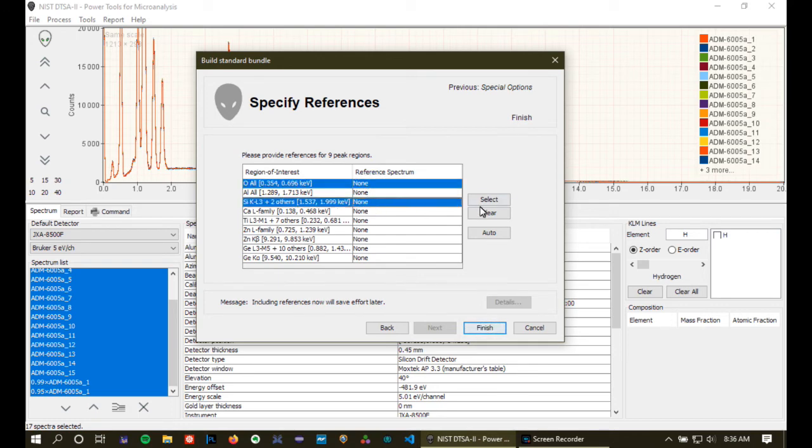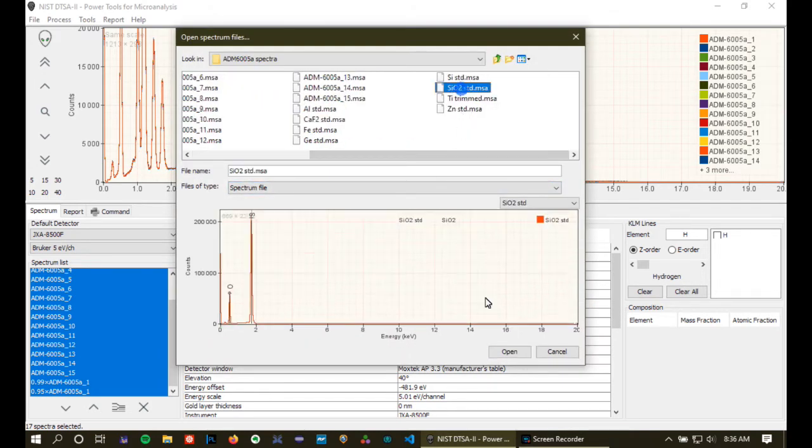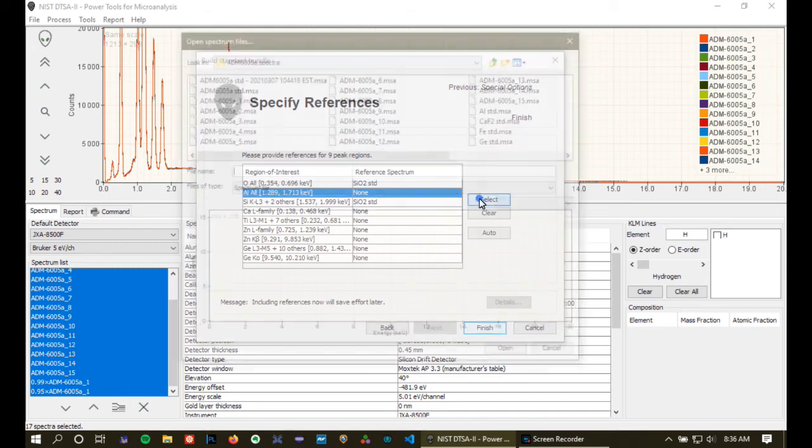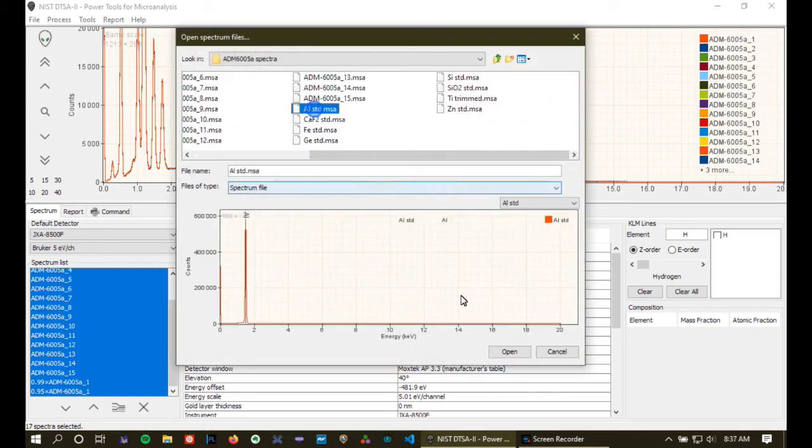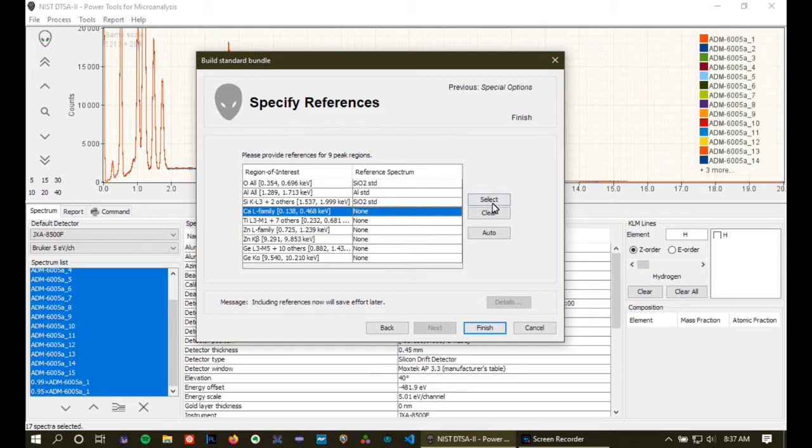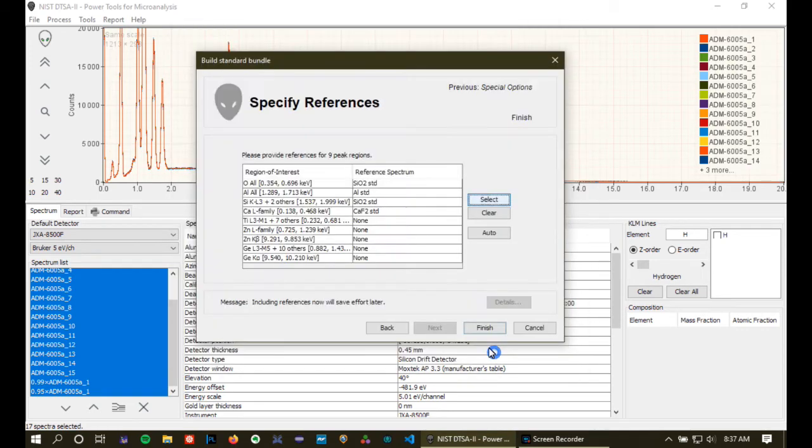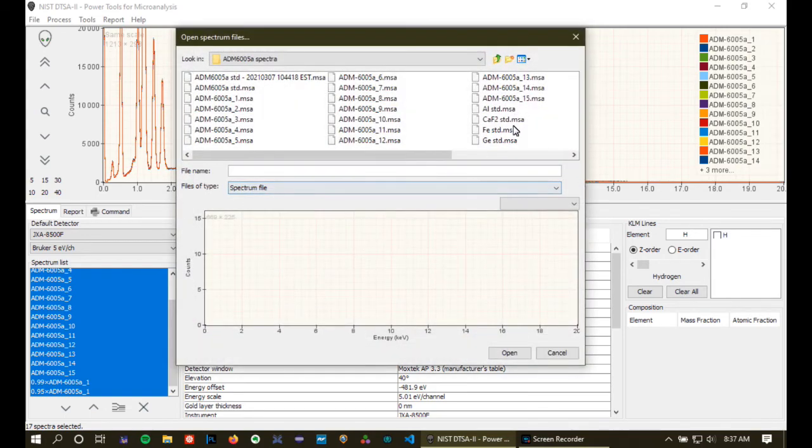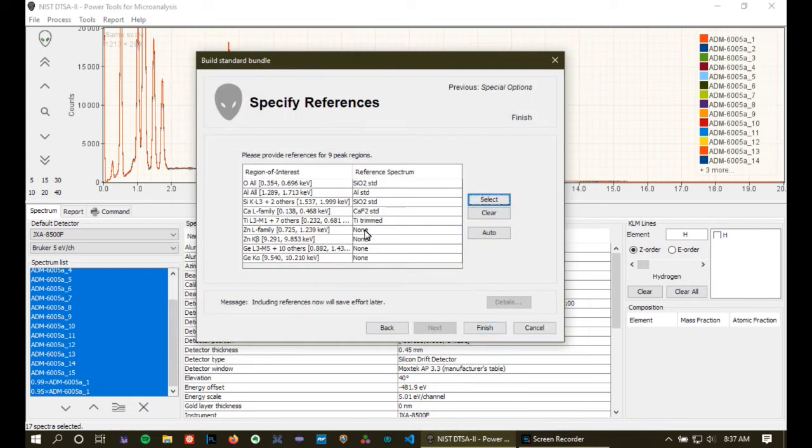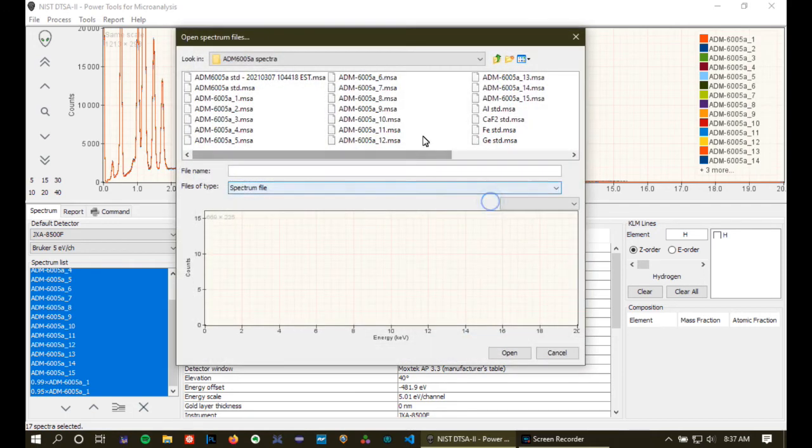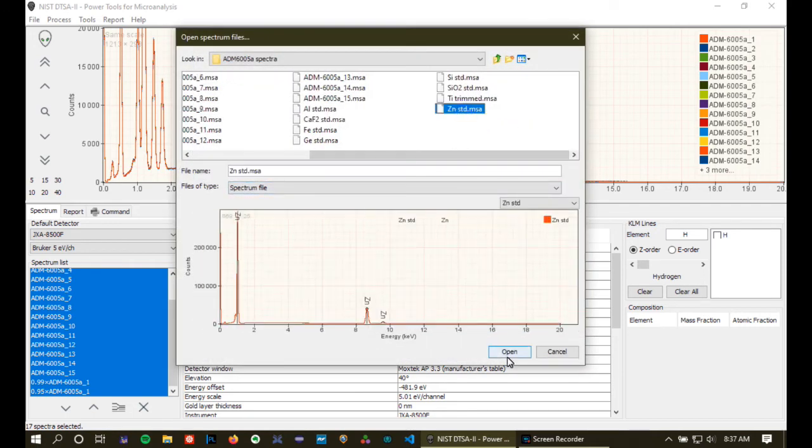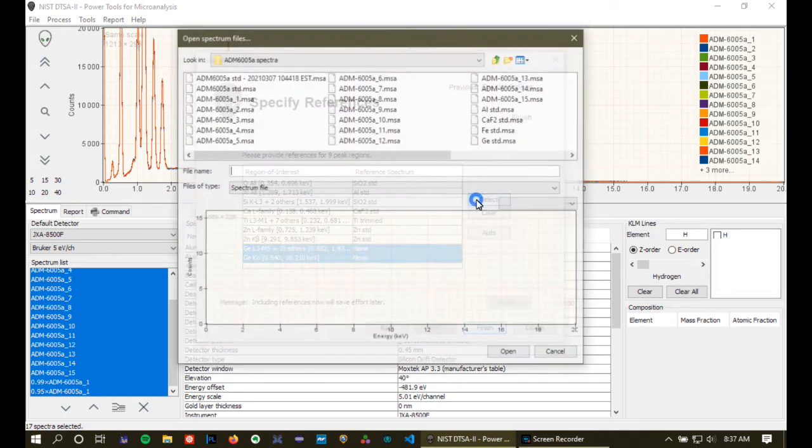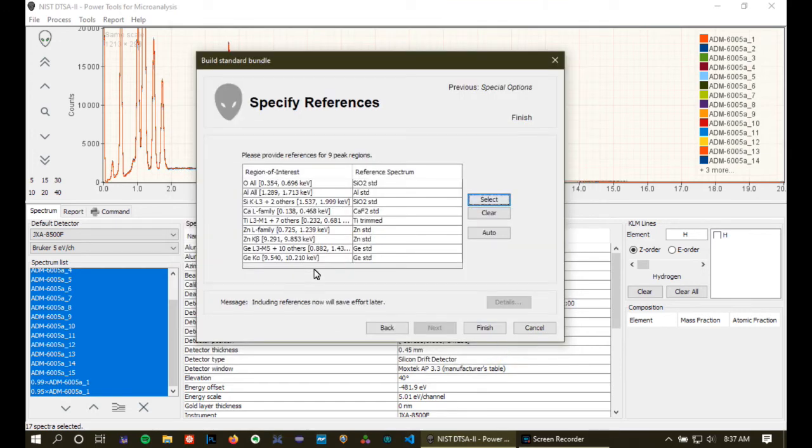In fact, we're going to use the spectra that we just used to quantify the material. So I'm going to select SiO2 for silicon and oxygen, aluminum, calcium, titanium, zinc, and germanium, both the L's and the K's, and one of the K's. Actually, the K beta is not interfered, so it doesn't need a reference. Okay. Now we're looking good.